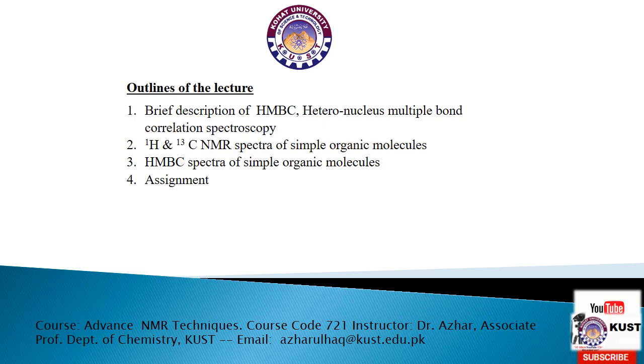As HMBC spectrum comprises 2 axes, as it is a 2D technique. The x-axis consists of proton NMR resonances, and the y-axis of the spectrum comprises carbon-13 NMR resonances of the compound. So you won't be able to understand the HMBC spectrum without knowing about proton and carbon-13 NMR spectra. And then HMBC spectrum of simple organic compound would be discussed, and at the end would be an assignment to know how much understanding has been achieved about the technique.